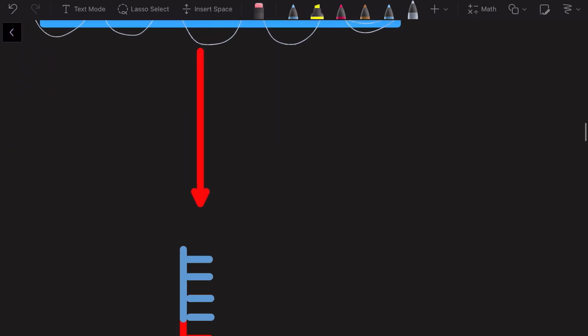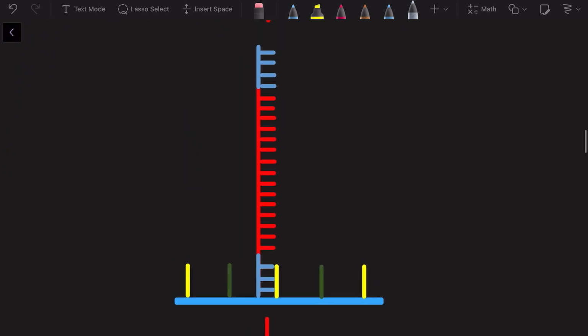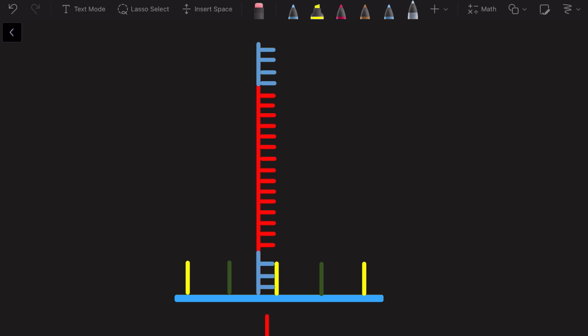As the fragment flows, under appropriate temperature conditions, we see here that this fragment gets attached to one of these oligonucleotide sequences, and this is how we separate out the fragments. Now you see that the fragment that we had created had adapters on both ends. There was an adapter here and there is an adapter here as well.